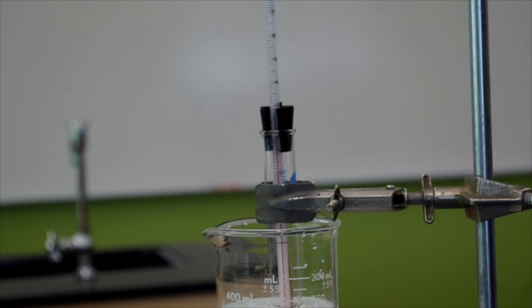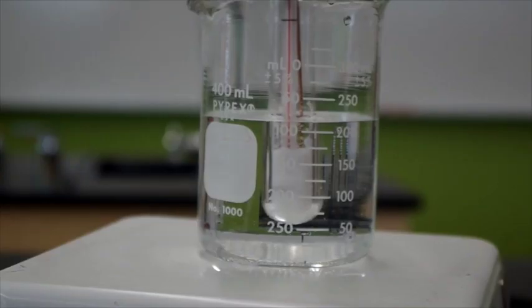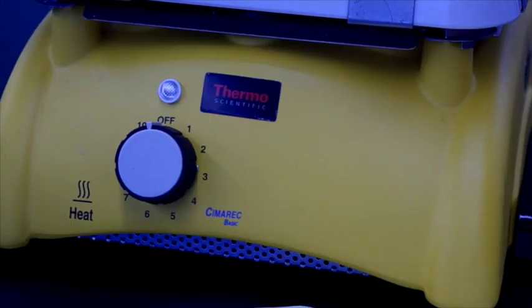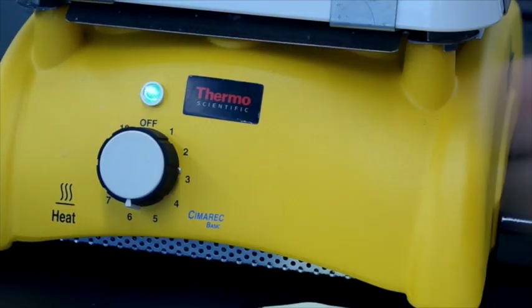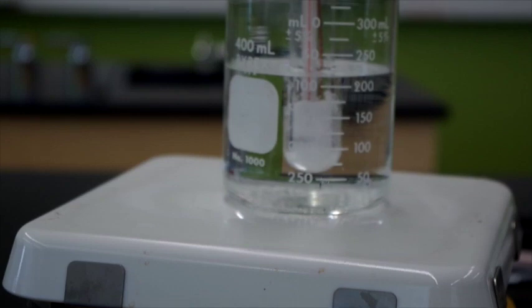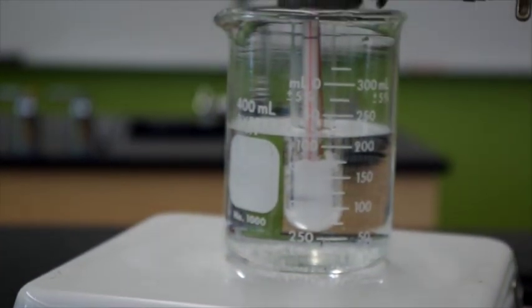Still read that, right? Yes. Go for it. We're turning it up halfway because we don't want the heat to go up as much for this one as we did before.